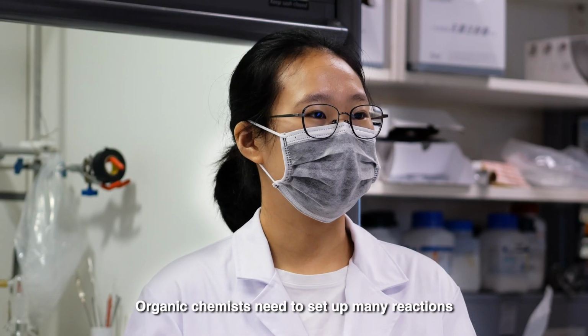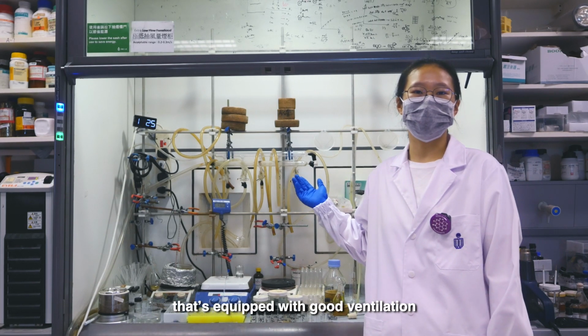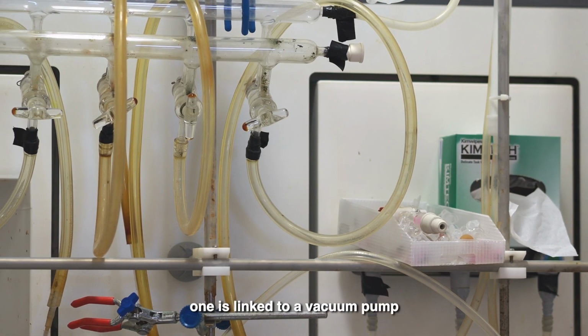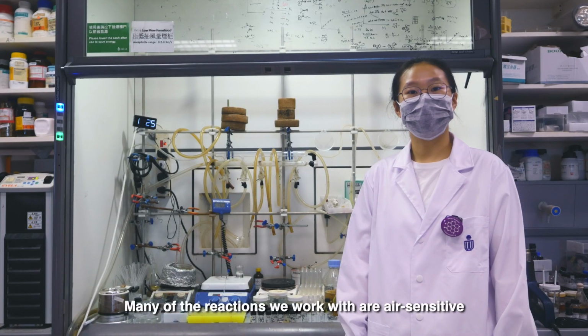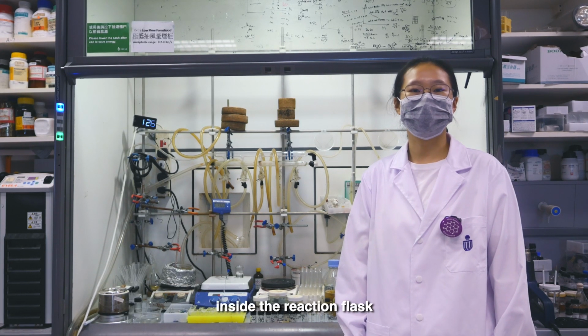Organic chemists need to set up many reactions, and most of them are carried out inside a fume hood that's equipped with good ventilation. This is the Schlenk line. It has two lines. One is linked to a vacuum pump, and the other is linked to nitrogen. Many of the reactions we work with are air sensitive. We use the Schlenk line to create a nitrogen atmosphere inside the reaction flask.